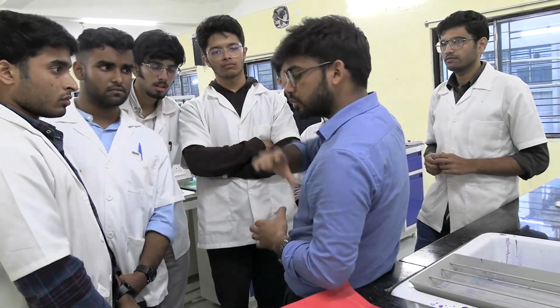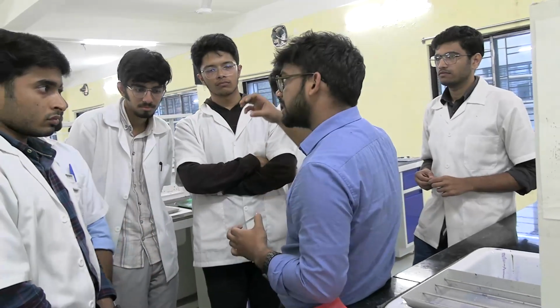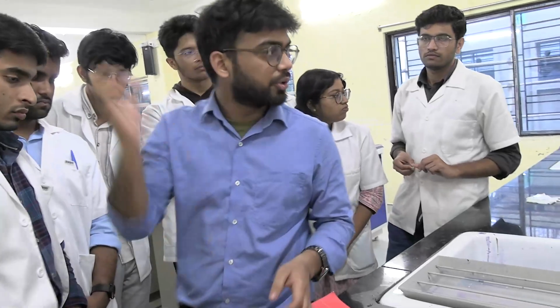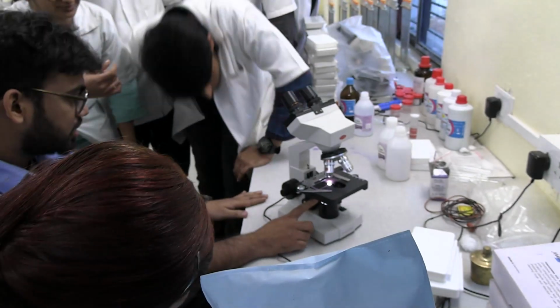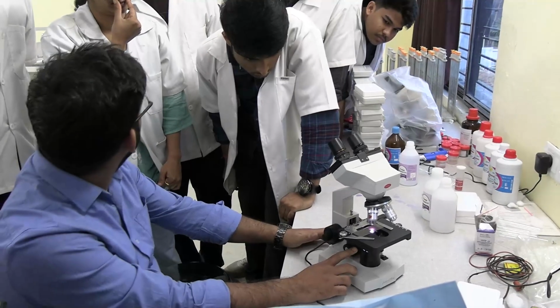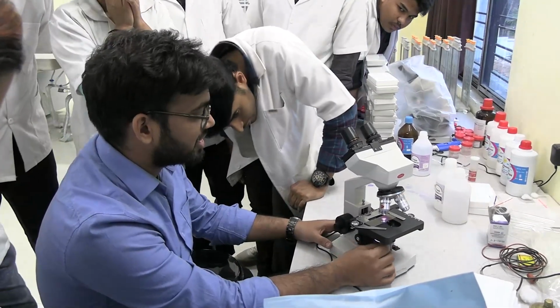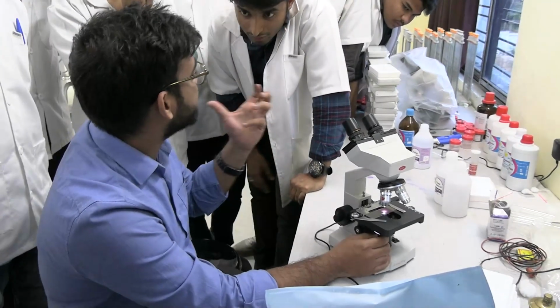You change your field like this. Change your field and you will get it. Focus and you will get it. Suppose it has become dry. Okay, now touch this. What is this called? Condenser only. And what is this? Light. Iris diaphragm.